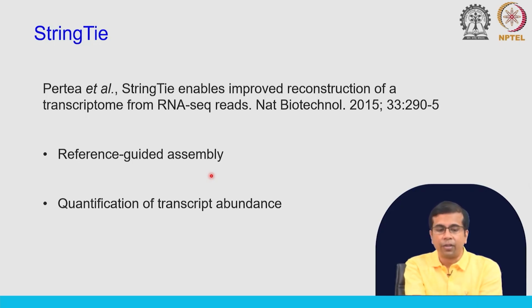Okay. So, how does this tool work? I will mention this very briefly. As I have mentioned, this is reference guided assembly. So, you have the reference genome. When you have a reference genome, you can have the alignment, right, reads will be aligned against the reference genome, and we know the alignment map, in the form of a BAM file or SAM file.